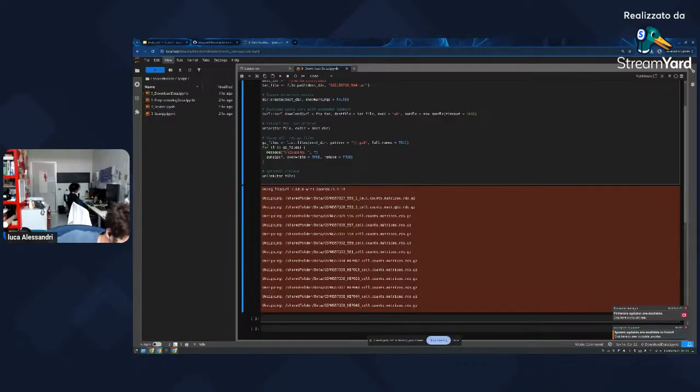RDS, and I'm pretty sure you already saw this in the last webinar, is a format in which you can load some table, this count table, right? The main problem is that in order to access it, you need Seurat. I'm not really sure if Python has packages that are able to read this type of format, but the standard format is the MTX format. My suggestion is always to stick with that.